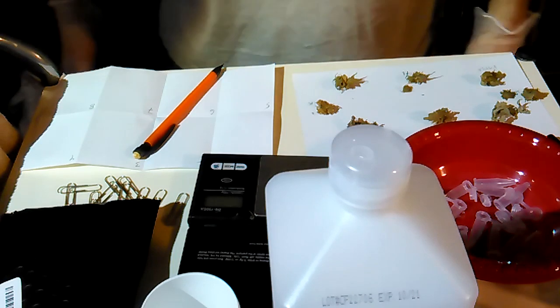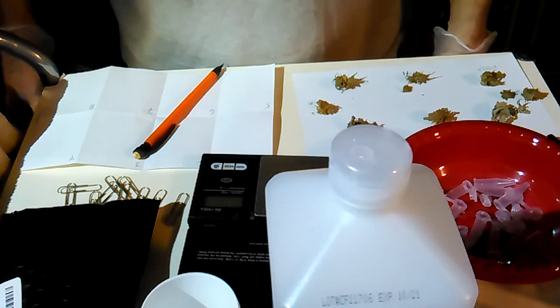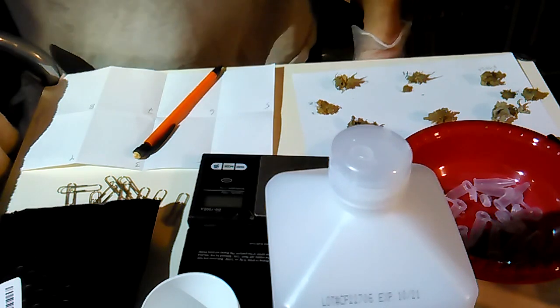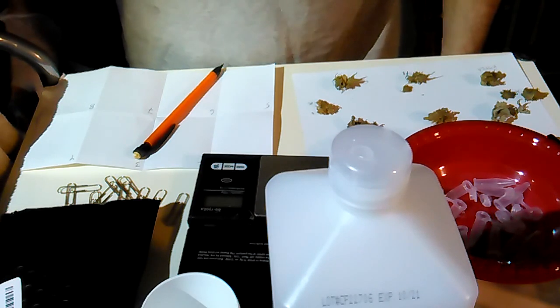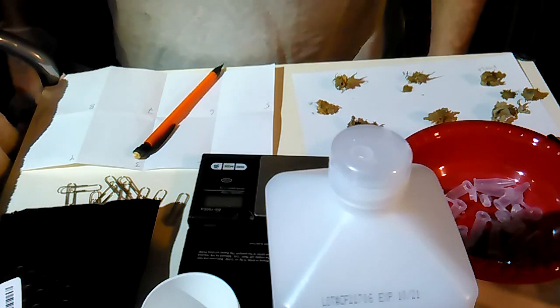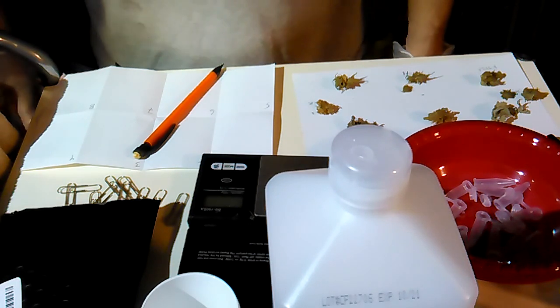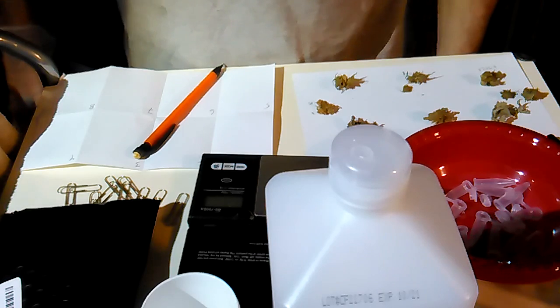We've been breeding high CBD strains, and so we need to run a lot of tests to figure out which plants have the high CBD, and so that gets expensive. So we've found another way to do the test, which costs almost nothing. It's called the beam test, and there's a few different variations on it.